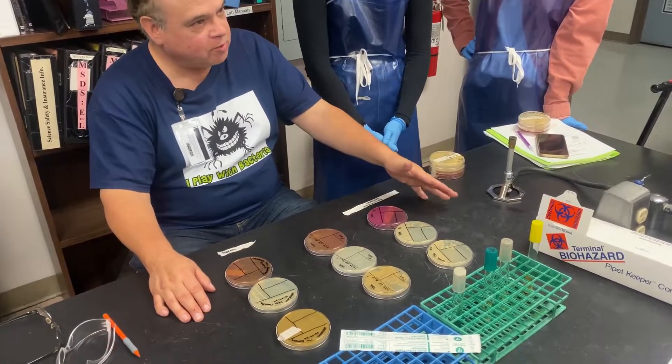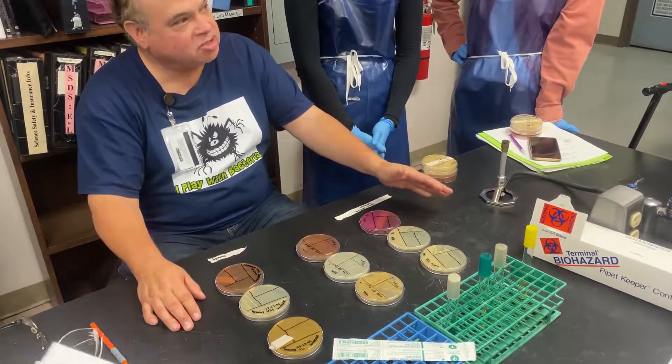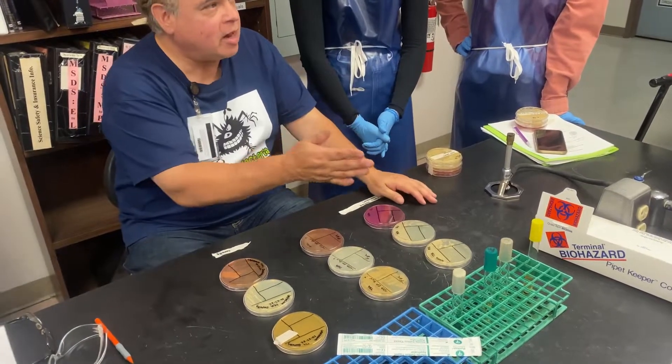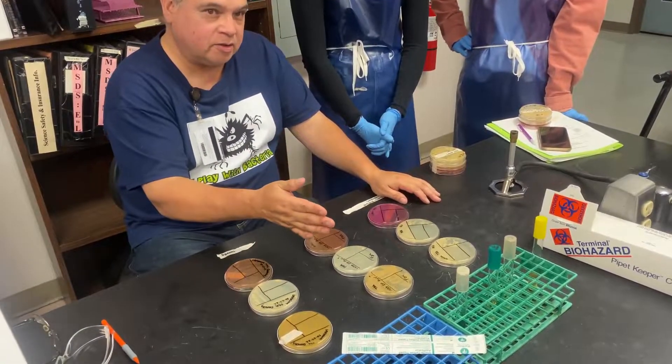Now that you've got your unknowns, remember there's two organisms here, a gram-positive and a gram-negative. I want you to think about how these plates are going to help you identify things.